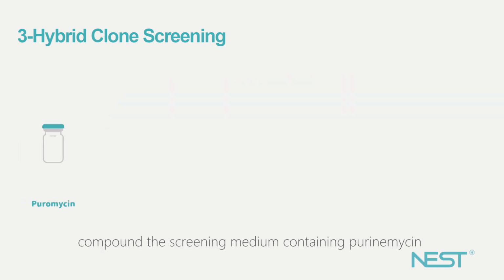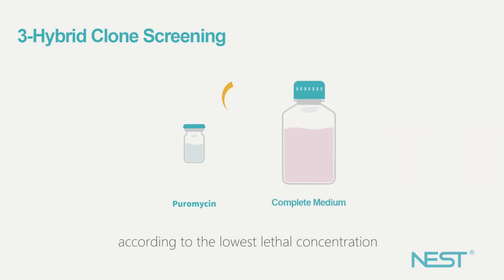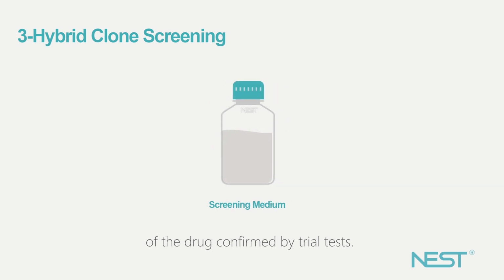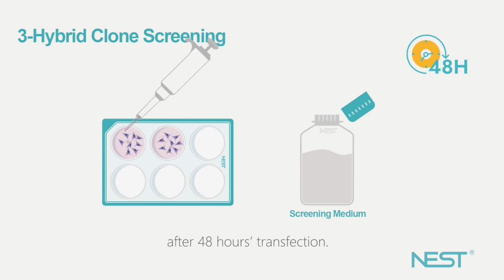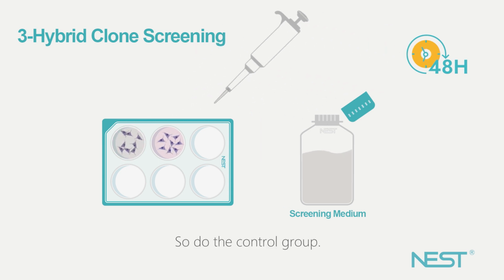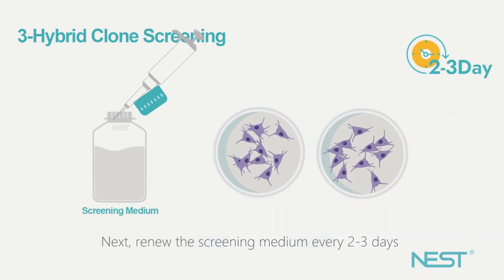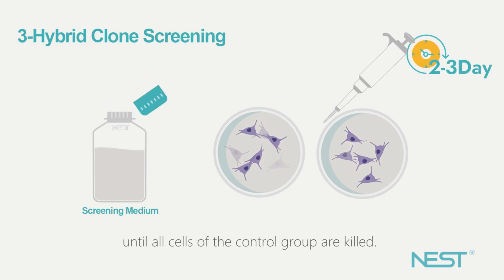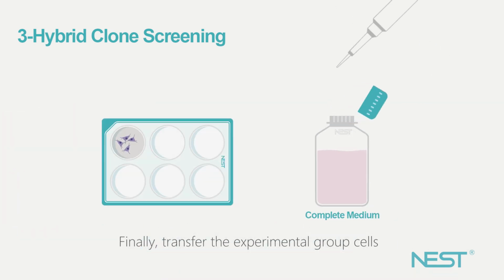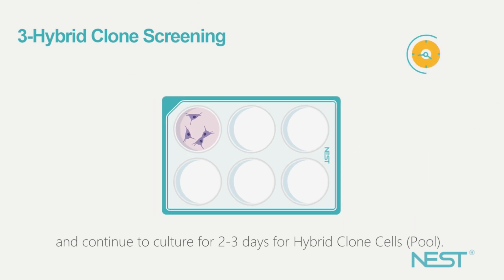First, compound the screening medium containing puromycin with complete medium according to the lowest lethal concentration of the drug confirmed by trial tests. Then replace the previous medium with the screening medium after 48 hours transfection. So do the control group. Next, renew the screening medium every 2 to 3 days until all cells of the control group are killed. Finally, transfer the experimental group cells back into the complete medium without drugs, and continue to culture for 2 to 3 days for hybrid clone cells.